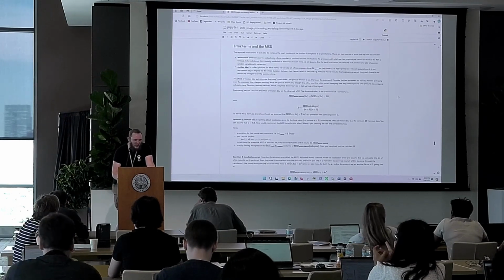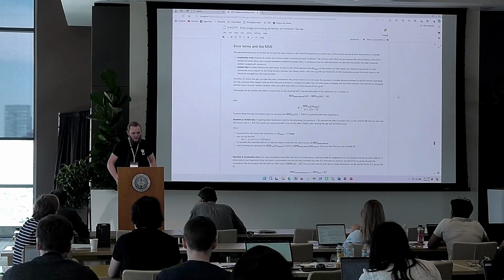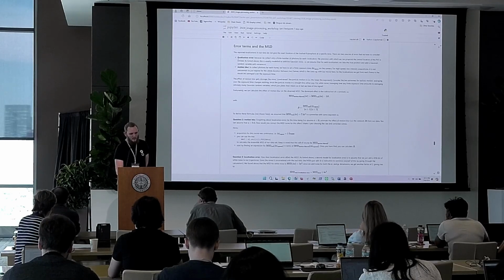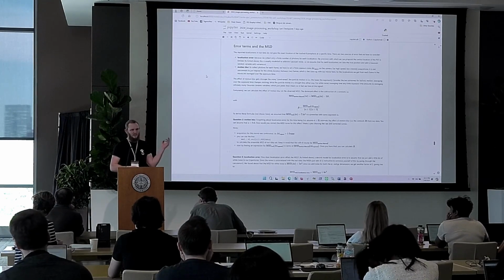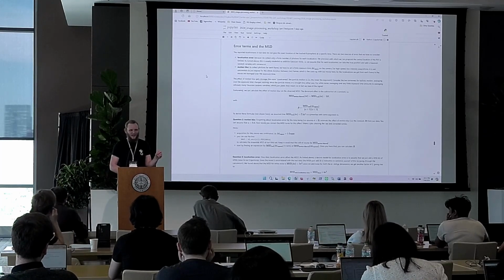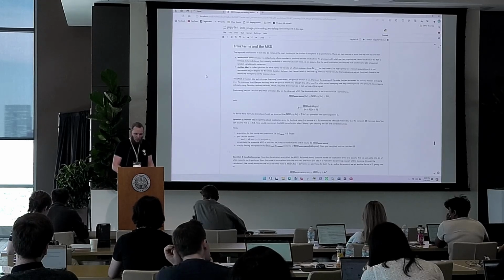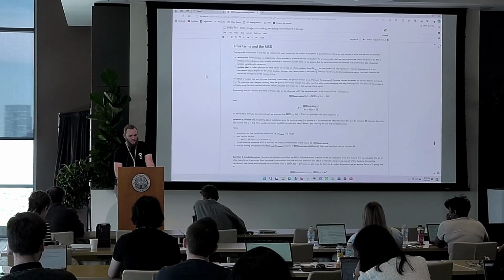Now, this, of course, is you can eyeball your data, but you can also try to be a bit more precise. There's two things that affect the MSD quite significantly, and sort of two error terms here. One is localization error and one is motion blur. Localization error means that your localization algorithm, in our case Thunderstorm, will of course not be able to pick up the localization of your fluorophore with angstrom precision, much less the location of the actual histone, because that's not where the fluorophore is. Anyways, the point is your localization will always be a little bit off, and this basically adds white noise to your MSD.